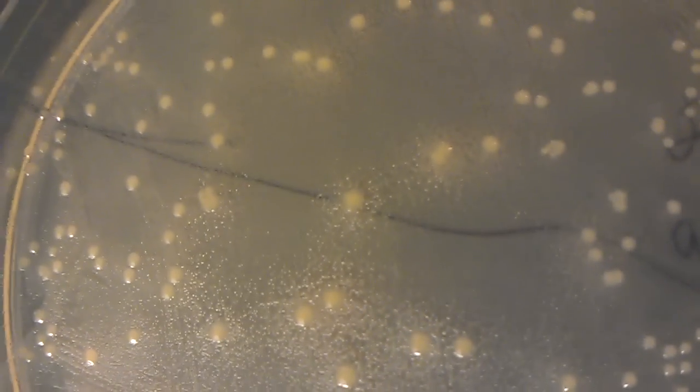So I'm going to try to zoom in a little bit more here, and you can see that we have, here, let me get something to point with. We have a few colonies there, and we have this central colony at the corner right there that I'm trying to point at. And then it has kind of this haze around it, like a lawn around it. And it's been a little while. This is a really old plate, so they've kind of all smushed together, but those are what we call satellite colonies, and those are bad. So if you were to pick here, you'd want to be very, very careful. You want only to get that center little thing right in there, and everything else around it is just no good.